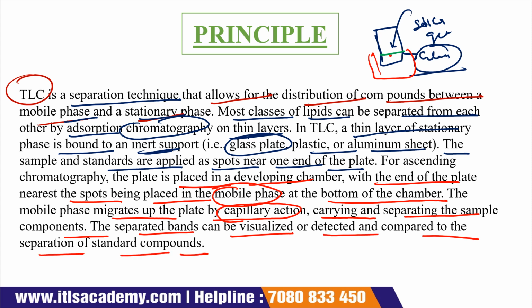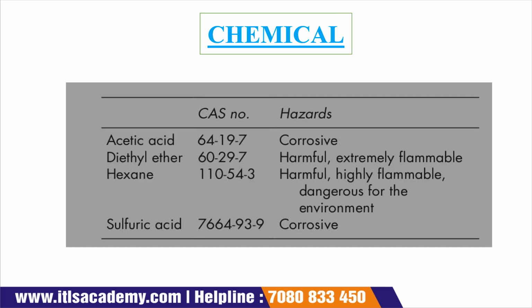Now what should we do? We separate the bands and visualize or detect them by comparing the separation with the standard compound. Now the next one, that is the chemicals used in this experiment.